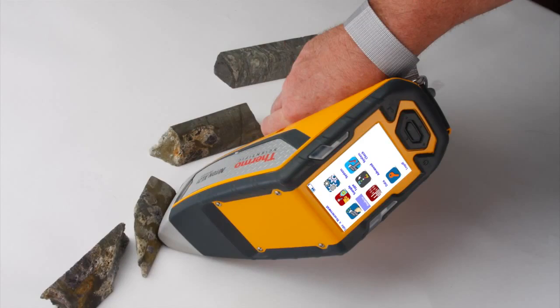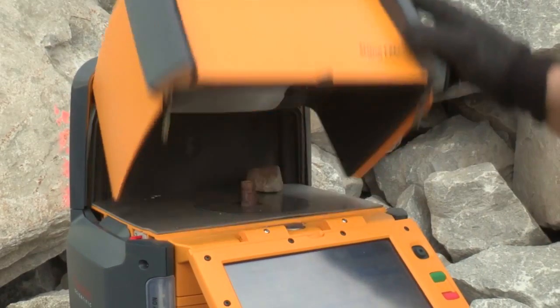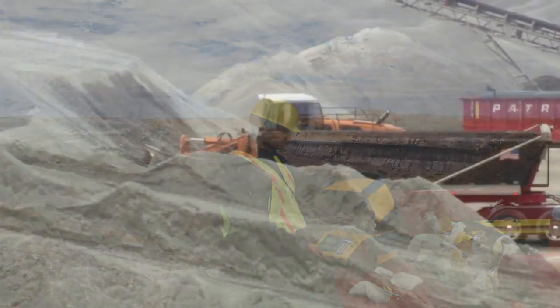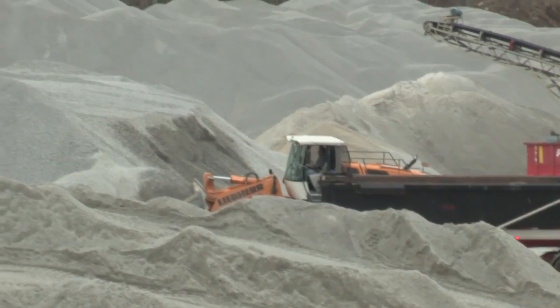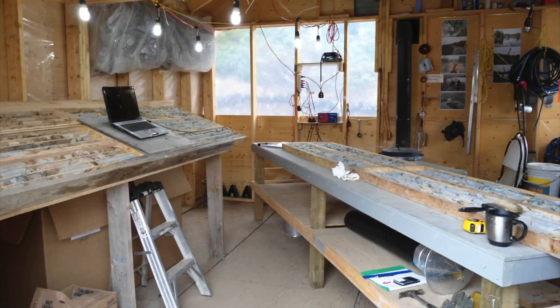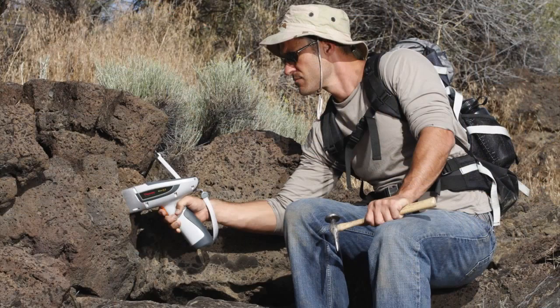Over 2,500 Thermo Scientific Portable XRF analyzers are deployed in the global mining market and can be found in large companies such as Barrick Gold, Codelco, and Anglo American, as well as in junior companies, even in the hands of non-geologists.